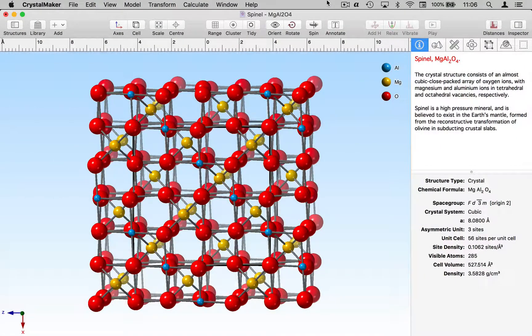Welcome to CrystalMaker 10. In this tour we're going to investigate placing a molecule inside a crystal structure.